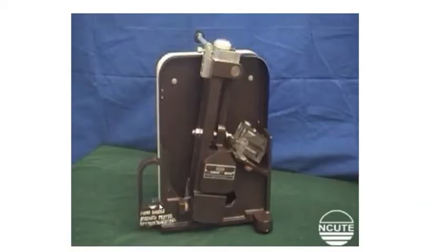This is the back side of the instrument. You can see the pendulum here. This is the pendulum. This one is the beam. The left side is the beam. This right side is the pendulum.